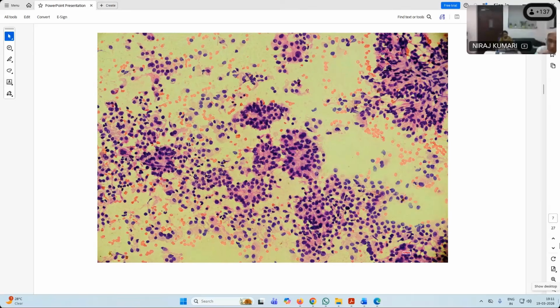So now you have to remember first what are the papillary lesions that can metastasize to cervical lymph nodes. So whatever you have told till now are the common sites. Okay. Any other site anybody can think of? Ma'am, nasopharyngeal. Nasopharyngeal will not show you this kind of papillary architecture.